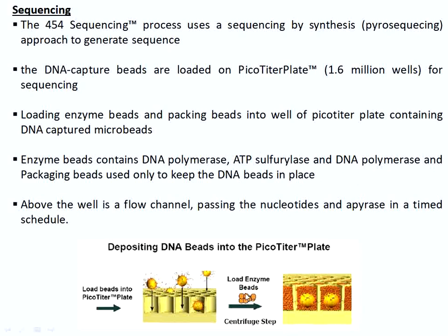So these enzymes are present in the enzyme bead, and the packaging beads are used only to keep the DNA bead in place within the well. So they help to maintain the beads properly within the wells, okay. So the two beads are loaded after the loading of the micro-sized bead on the picotiter wells.